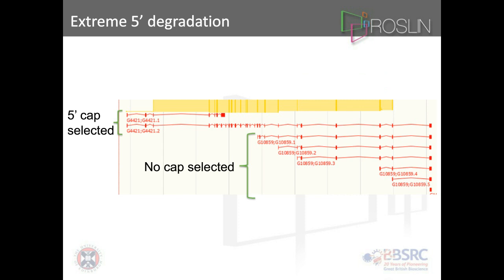Here's an extreme case of 5' degradation. We had a non-cap-selected library at the bottom compared to a 5' cap-selected library. In the non-cap-selected library, we never even got the full length of the transcript — actually less than half. This is quite problematic because without the cap-selected library we wouldn't have known we were missing more than half of it. This would cause issues identifying open reading frames, coding potential, and promoters — the promoter is at the true transcription start site shown in the cap-selected model.